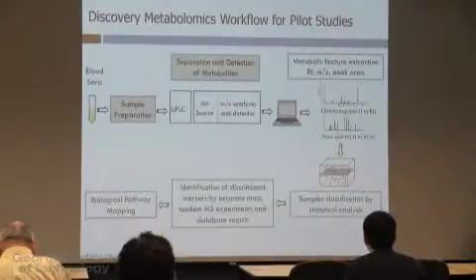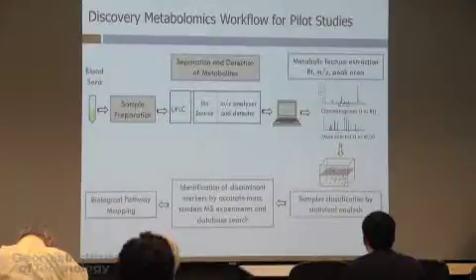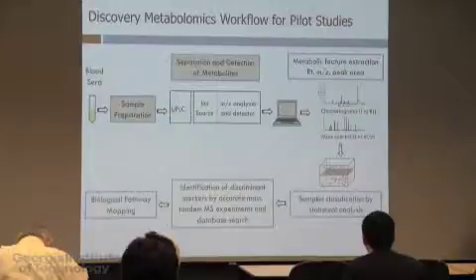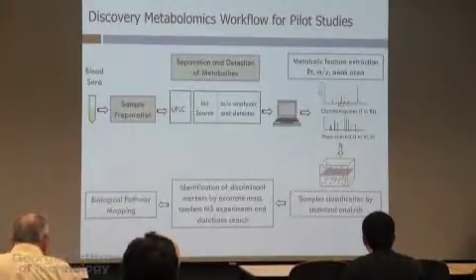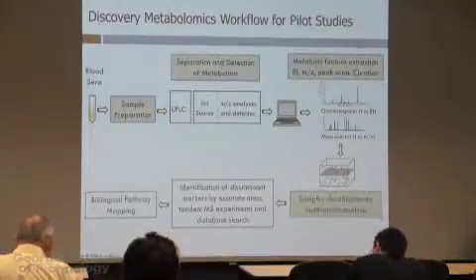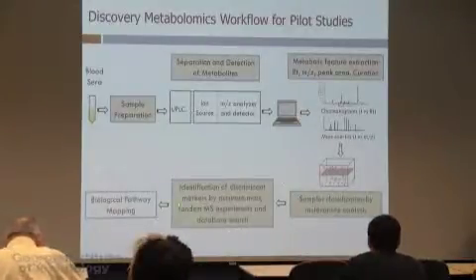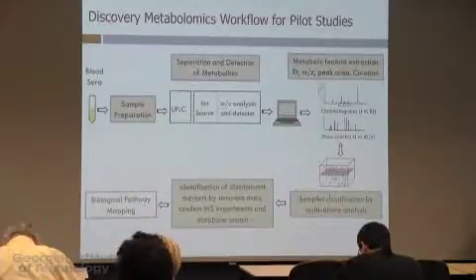But once you go over that step and you're sure that the data is as clean as you can, then you're ready to go and talk to your bioinformatics colleagues and start playing and trying to see, is there a function or is there a set of metabolites that I can use to separate, let's say, early stage from control mice? Or the answer may be no. Sometimes there's no way of separating it. Sometimes it doesn't work. Okay, so we curate the data, and then we do multivariate analysis. And then once you know those metabolites, you're going to identify them, and I'm going to show you how to do that. And then you need to map them back into pathways. Okay, so you go from blood all the way to pathway mapping.